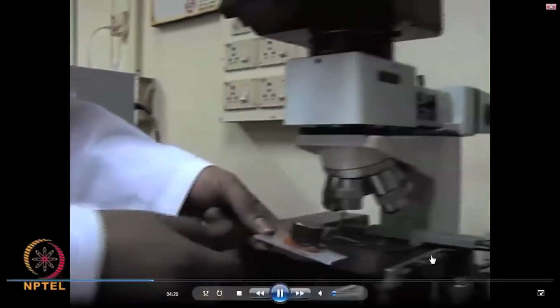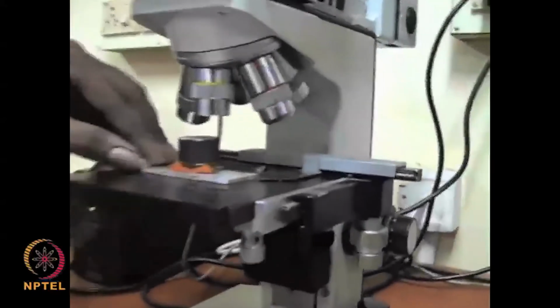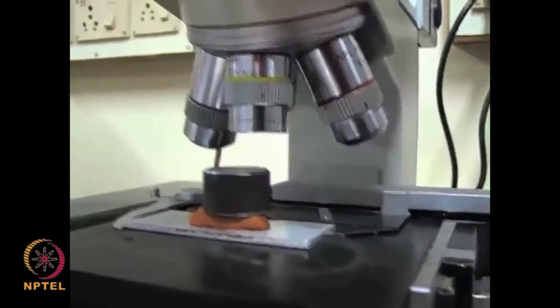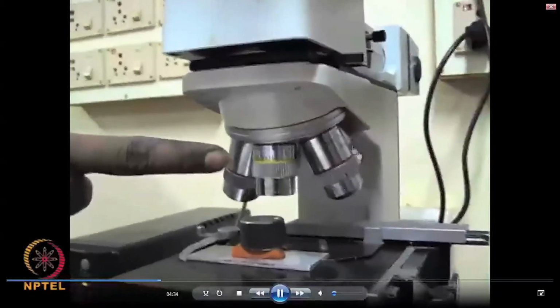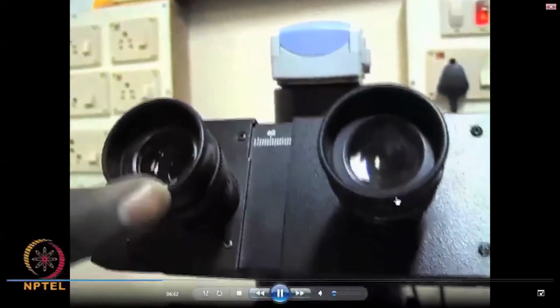You can see that the specimen is being loaded on the specimen stage, and then you choose the appropriate objective lens. You can start with the lowest magnification and go to the highest. The magnification is the multiplication of the objective and the eyepiece.